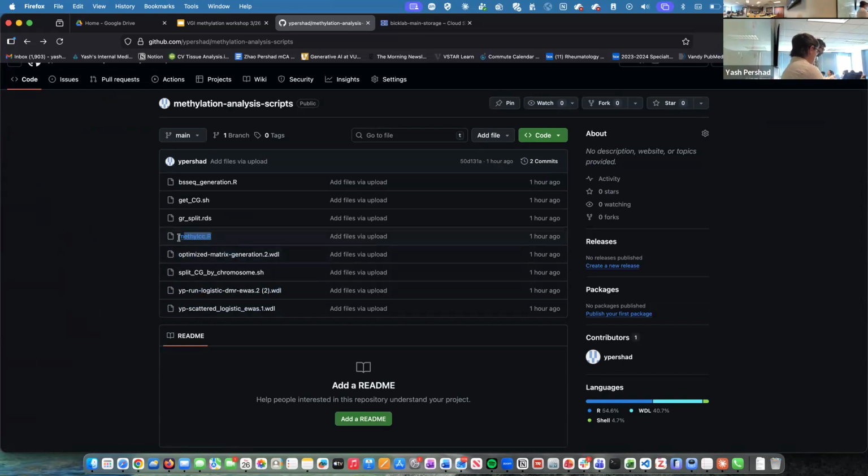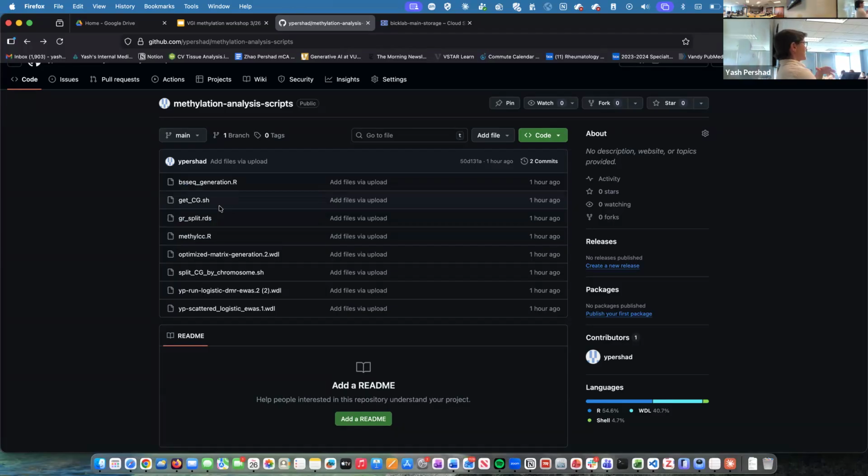And then this is how you can run methylCC locally with this R script, which takes a single CX report file and estimates its cell proportions, which is probably useful to test things out. That requires this input, which is a genomic range split file. These two are generated from the Leo lab on how they process CX report files. So the top two are just going from CX to matrix, and I'm happy to provide any scripts. I work mostly with the binomial modeling, between Bash and R. We have slightly different pipelines, but they're basically doing the same thing.